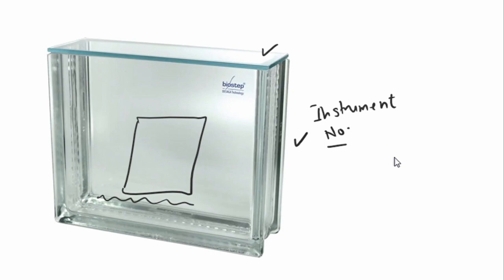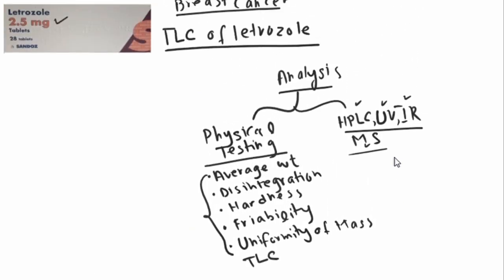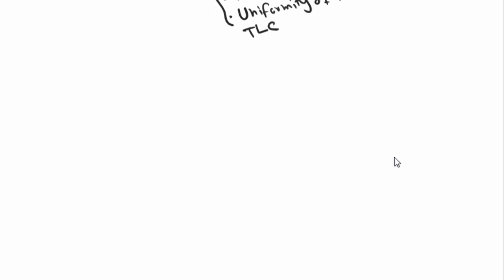Before going into the depth of how the mobile phase is prepared and other things, I will give you a brief introduction, and then we will move on to the specific instructions for letrozole.